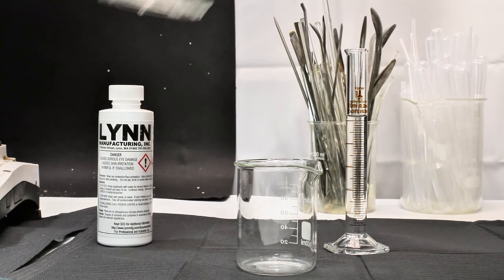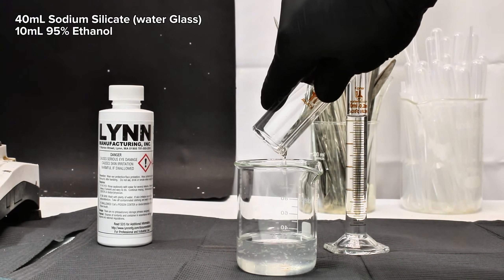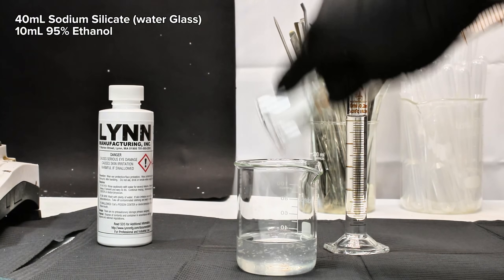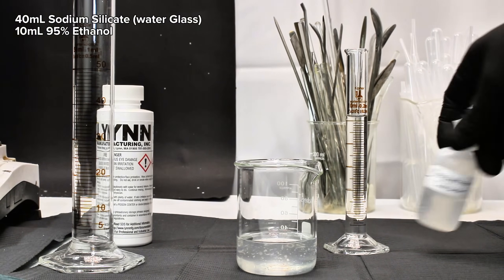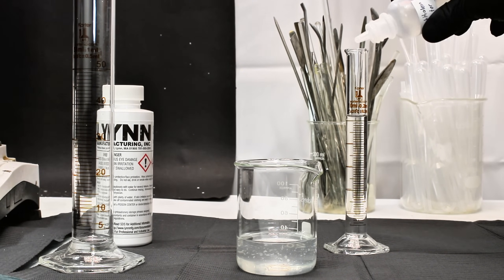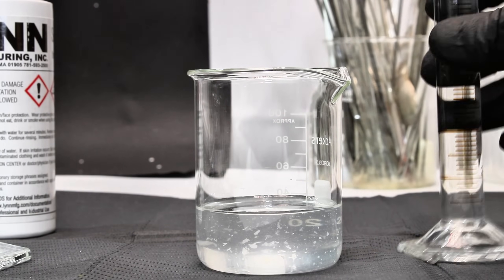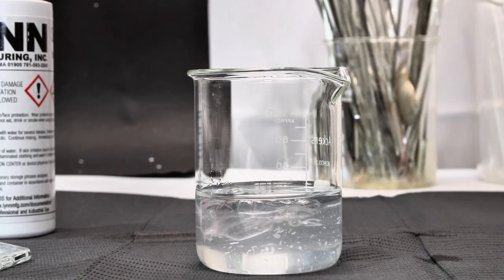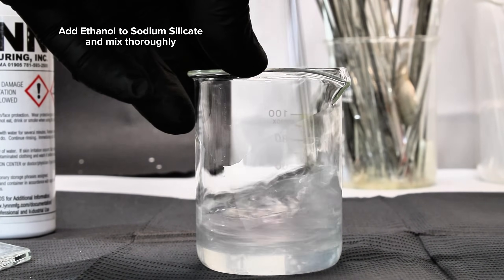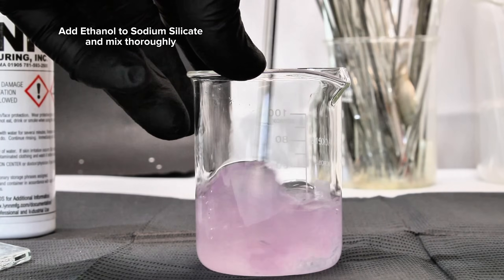To get started, I simply measured out around 40 milliliters of sodium silicate and just over 10 milliliters of 95% ethanol. Sodium silicate is sold as water glass, and you can make it yourself by dissolving either elemental silicon or silicon dioxide in a very strong solution of sodium hydroxide. The sodium silicate is then transferred to a small beaker, followed by the ethanol. These two are then vigorously mixed, which will quickly result in a crumbly solid mass that's impossible to stir.